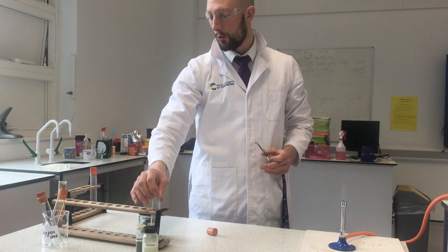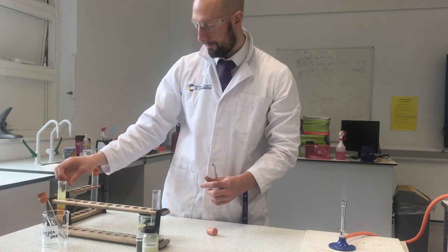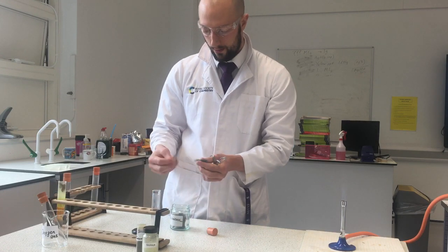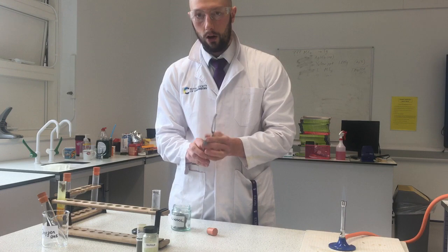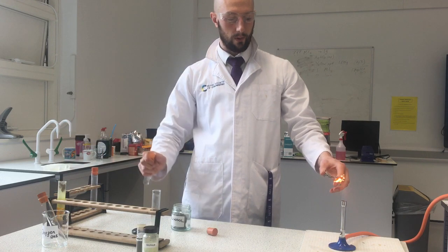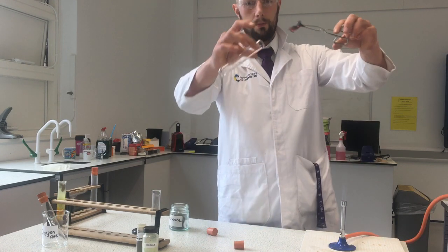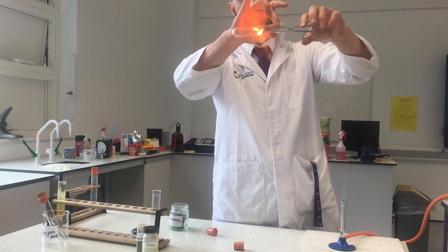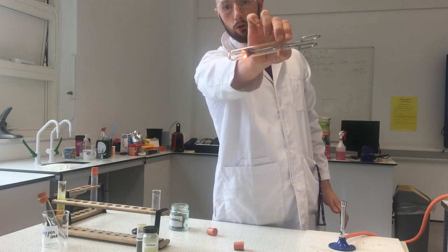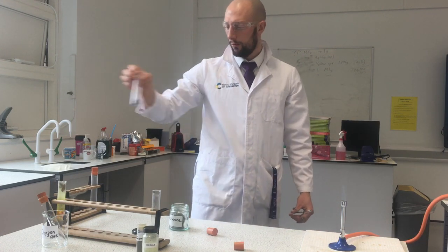I will show you that one more time because I've got plenty of oxygen gas. I get a piece of steel wool, which is iron. I'm going to get it hot in the Bunsen flame. Look at that, straight away we can see it's doing something. Nice and hot, ready to react, and then into my pure oxygen. There we go, that's a clear, strong reaction between the iron and the oxygen. Much better than we saw between the iron and the sulfur.